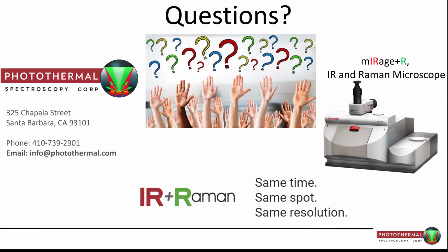Okay, I think the next one, Brooke, might be sort of directed at me, or at least I'll take this one. The question says, how do you handle fluorescing samples using a green laser, and are other options available? So firstly, let's be very clear, whether it be in anything that I've said or Brooke has said, that the infrared side, because we can do infrared and Raman.